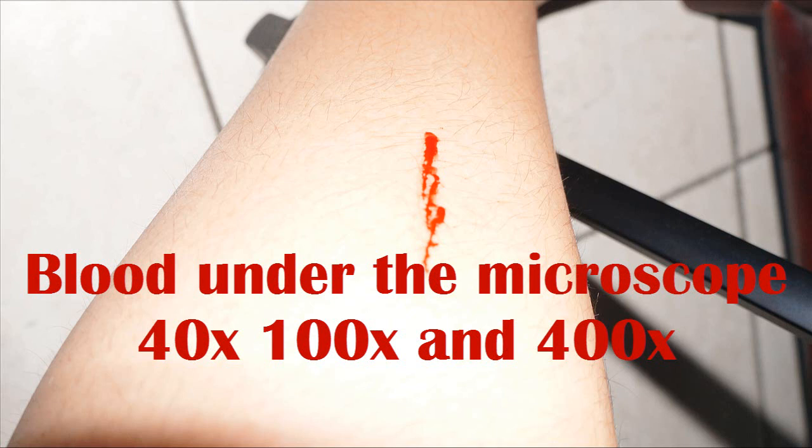I recently cut myself and I thought I will show you how blood looks under a microscope. For all of those who want to do this experiment, please don't go and cut yourself. If you accidentally cut yourself and wish to do it, or have some external blood source such as meat, you can do it easily by just taking a small blood sample, putting it on the slide, adding a cover slip, and just going in the microscope.